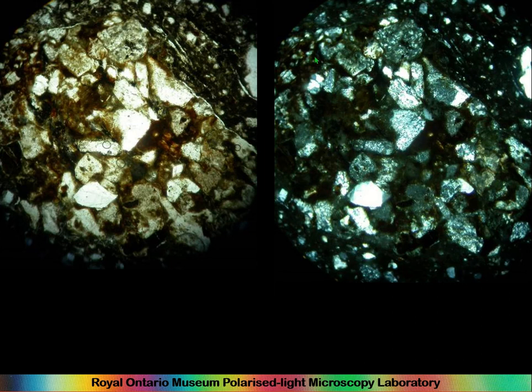And so quite often, one thing you'll find is if you have fragments of sandstone, you might find that there are sand grains throughout the pottery matrix of exactly the same size and sortedness and mineralogy as the sand grains in the sandstone. Because quite often what happens is this has been broken down to make tempering for the pottery.